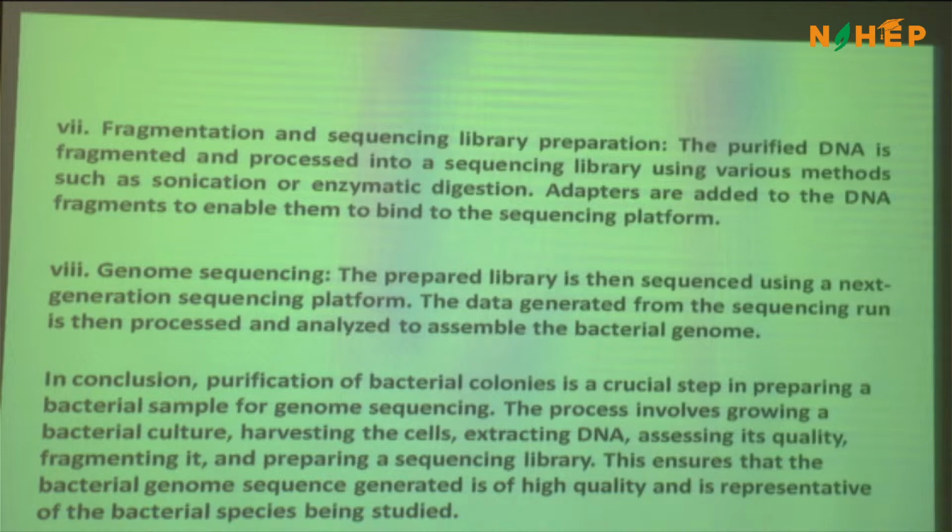Aggregation, I think most of you might have heard about bacterial biofilm aggregates, because they cooperatively live there so that the cells are protected from desiccation and other vagaries of weather, right? I'm sure in rhizosphere also the story is the same, right? So you have to detach the cells from the surface. For that, perhaps the Tween 20 might help you.